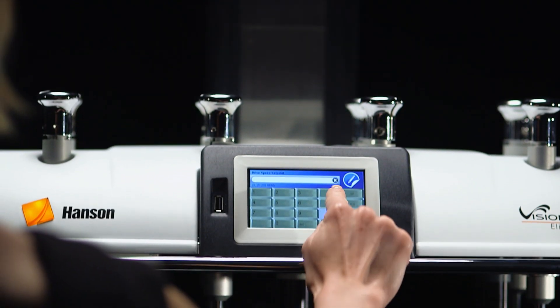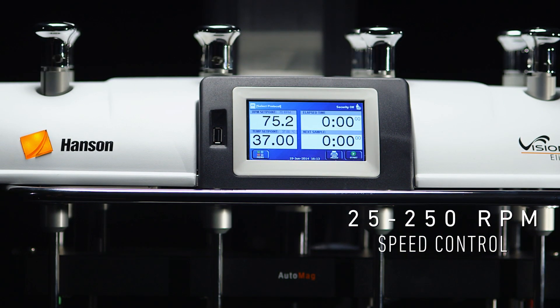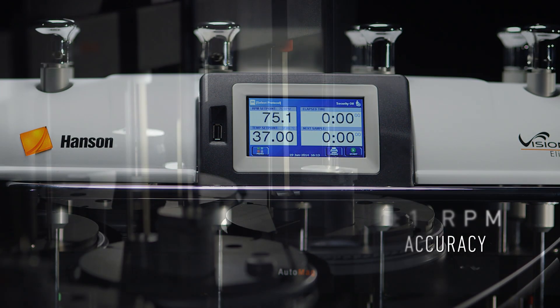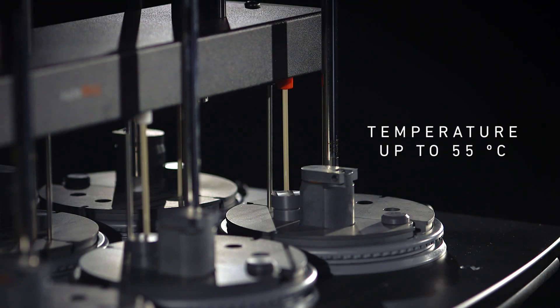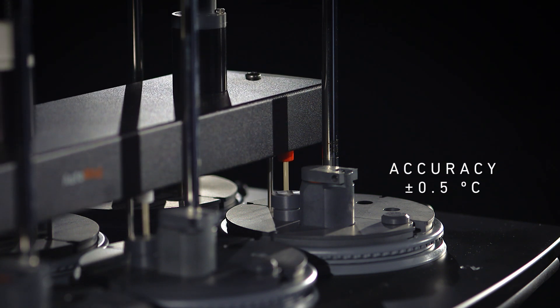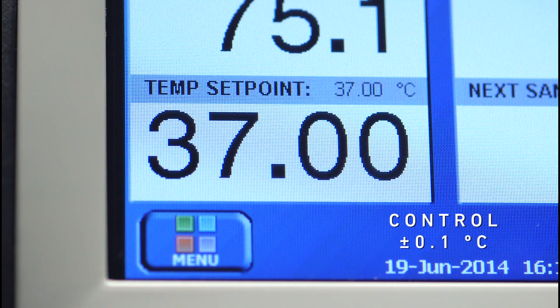Precision speed control ranges from 25 RPM up to 250 RPM, with an accuracy of plus or minus 1 RPM. Programmable temperature up to 55 degrees Celsius, with an accuracy of plus or minus 0.5 degrees and control of plus or minus 0.1 degrees.